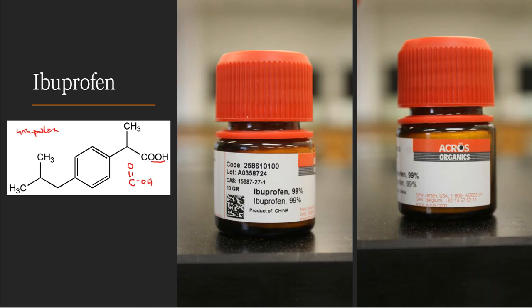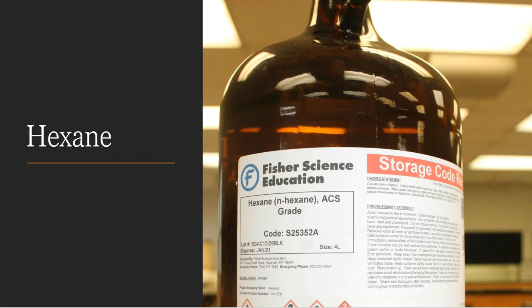All right, so out of the lab directions, it's now going to tell me to pull my mobile phases. So these are the solutions that my plates will be dunked down into inside of the chamber. And the very first mobile phase that it tells me to pick is hexane. Well, I hope good and well that you can give me the structure of hexane at this point.